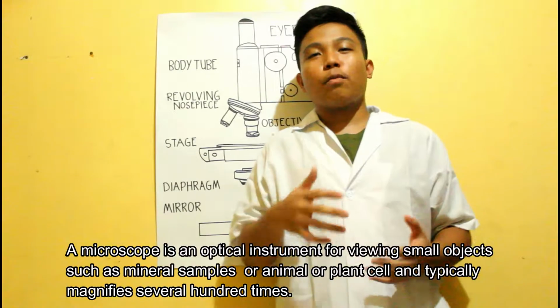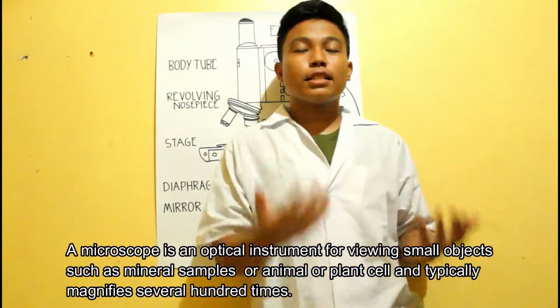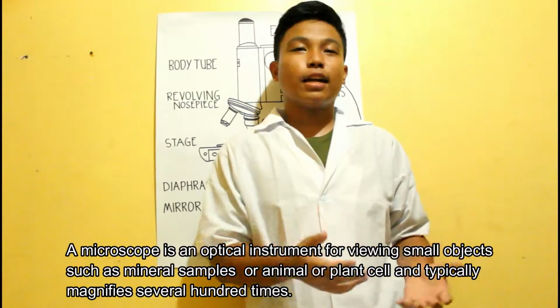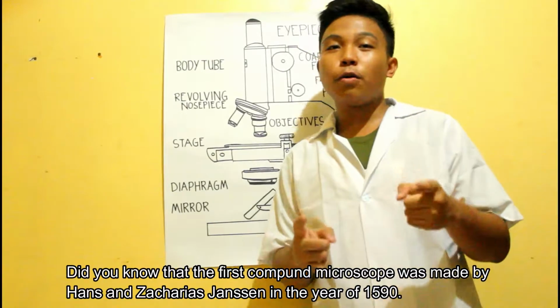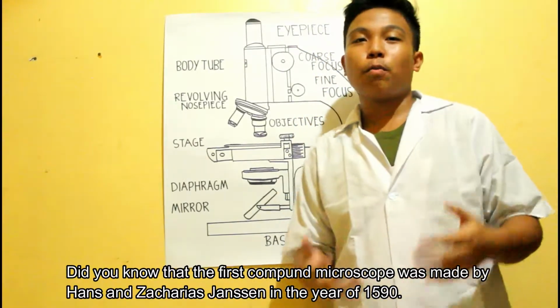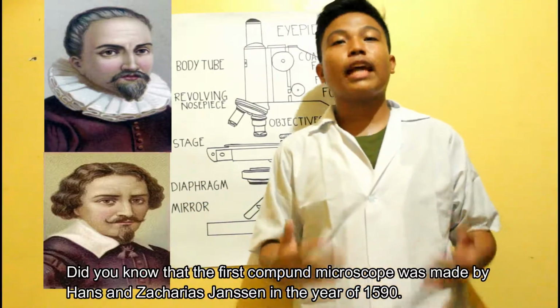So, a microscope is an optical instrument for viewing small objects such as mineral samples or animal or plant cells, typically magnified several hundred times. And did you know that the first compound microscope was made by Hans and Zacharias Janssen in the year 1590?